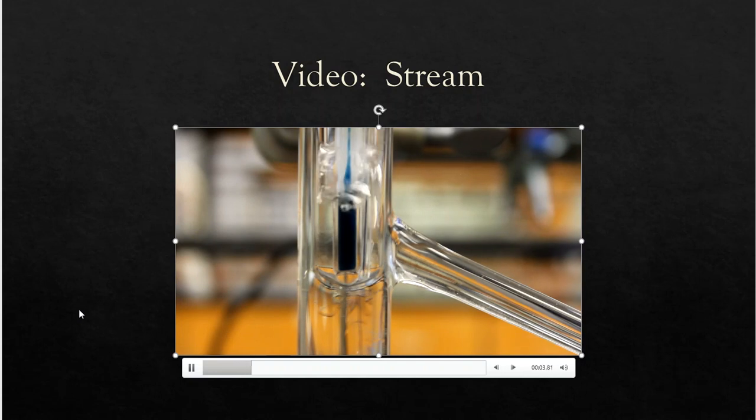Okay, so you're starting to see the bubbles happen pretty vigorously at this point. I'm going to take the heat away, and I'm going to sit here and watch for that very last bubble to come out of that capillary tube. I'm getting closer and closer to the boiling point. That's basically what that means. However, my thermometer always lags.